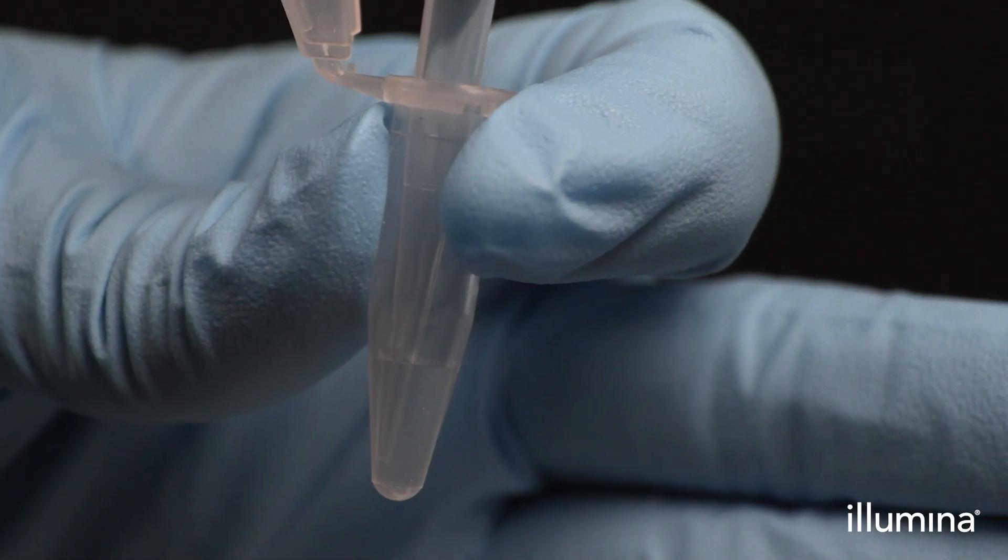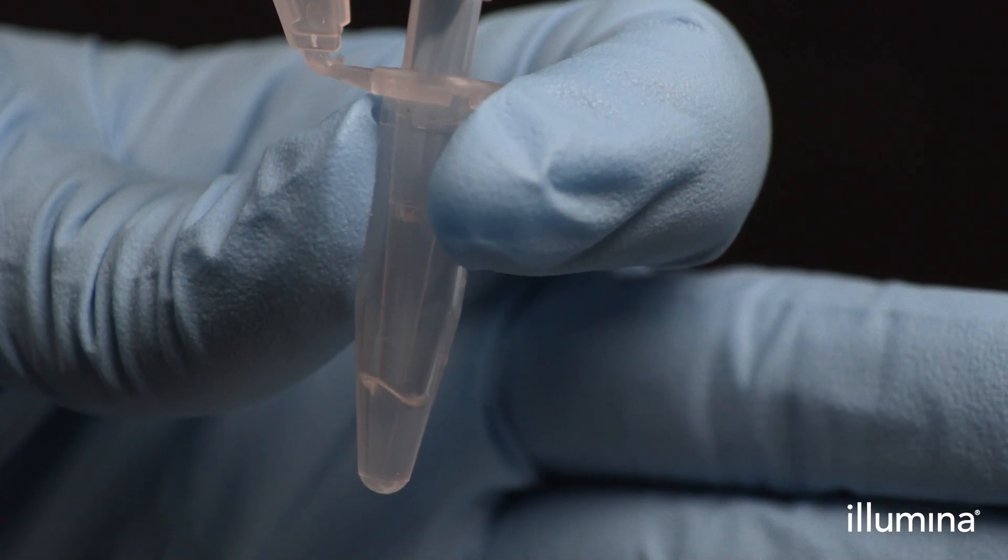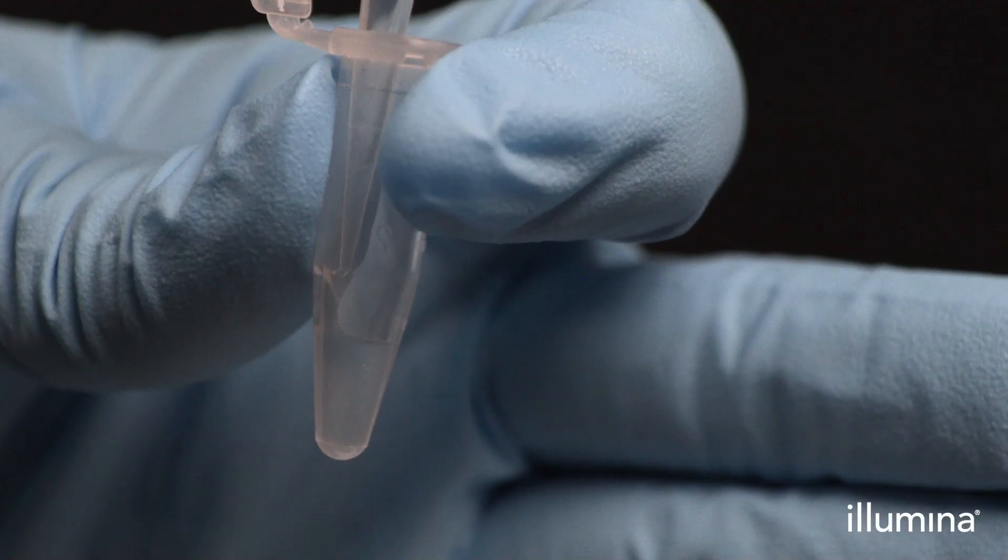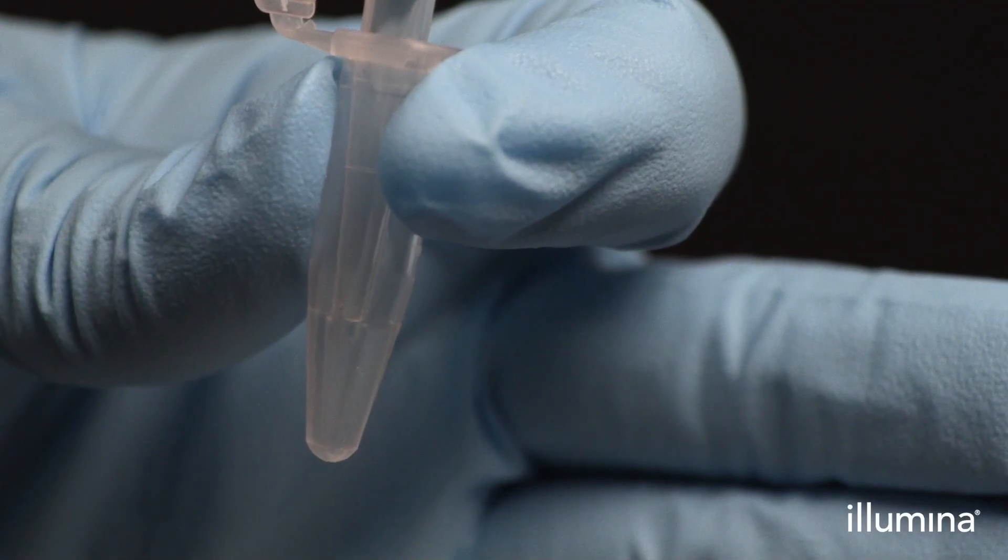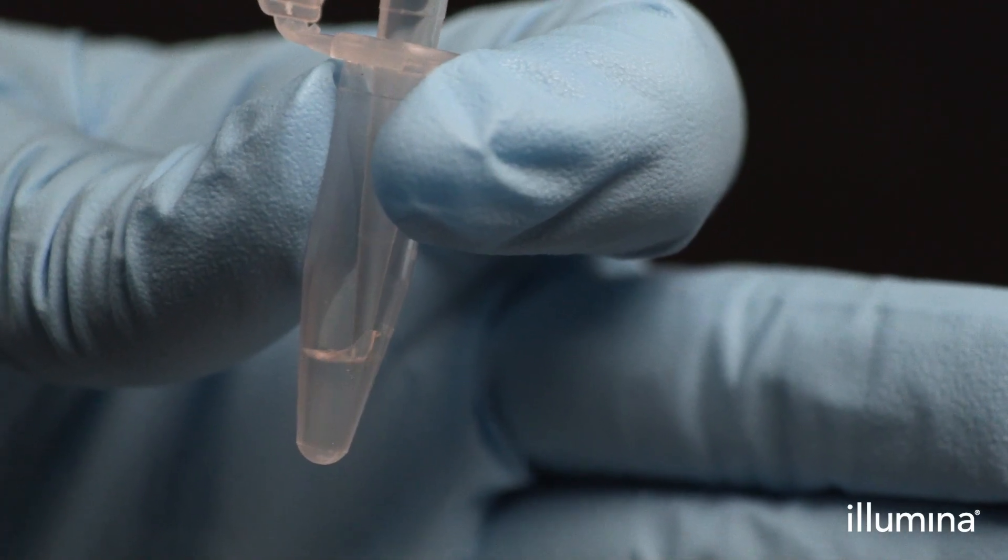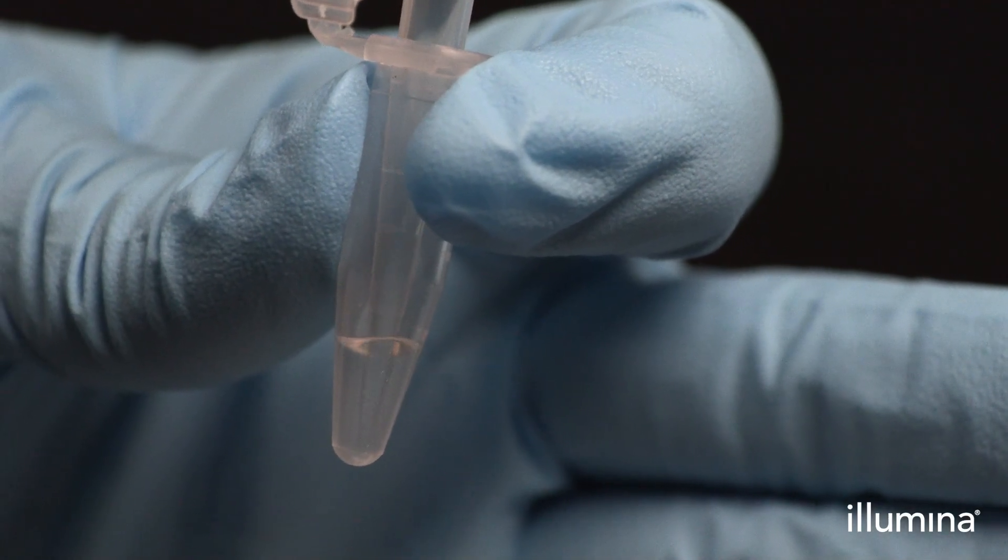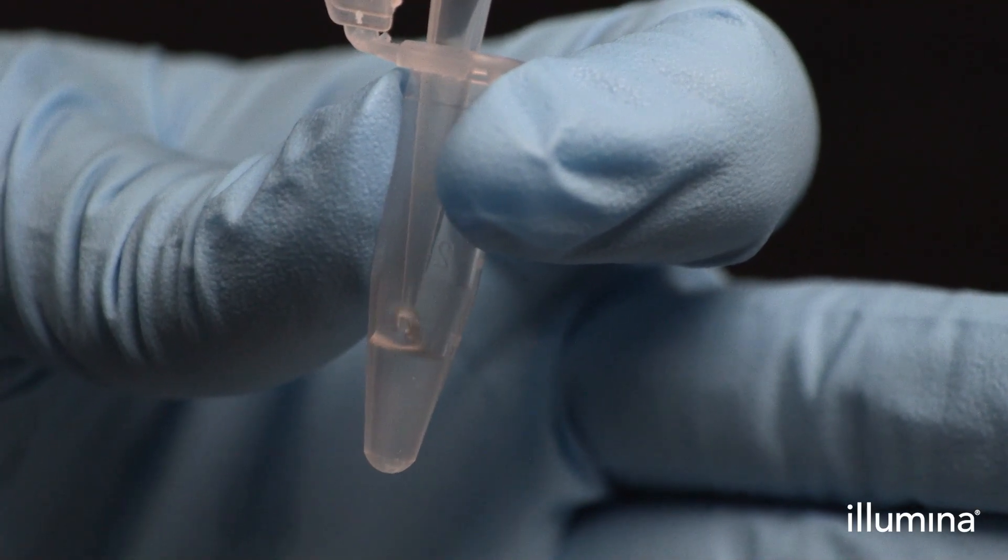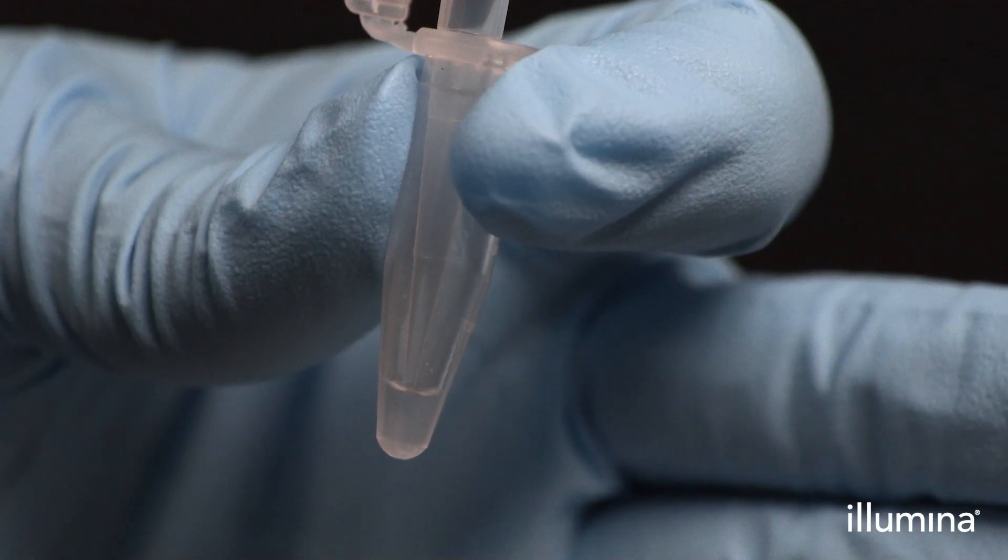Then, pipette mix each sample ten times using a standard-bore, low-retention P200 tip to ensure even dispersal of the sample. It is important to pipette slowly to the first stop only to avoid creating foam or excessive bubbles. This step should be completed with the pip tubes in the four-tube stand. We are not showing that here, so proper mixing can be observed.